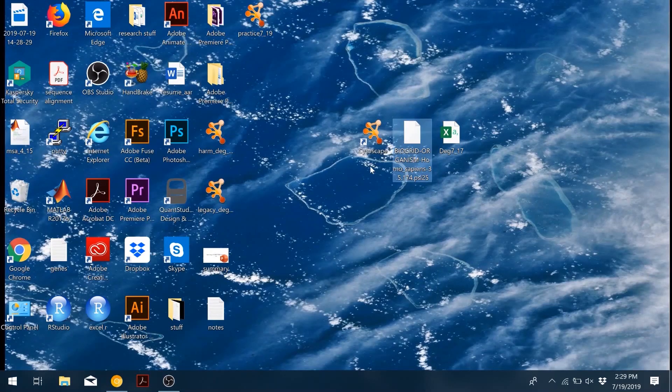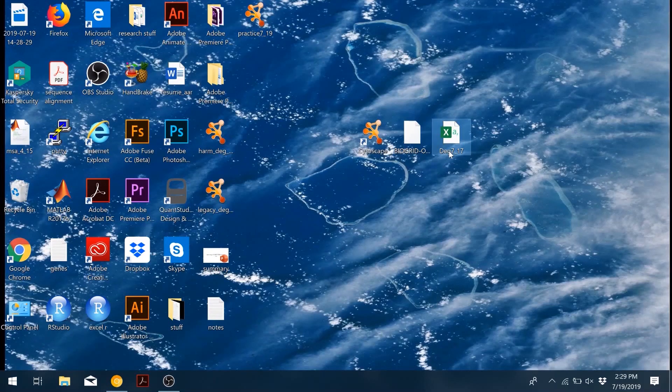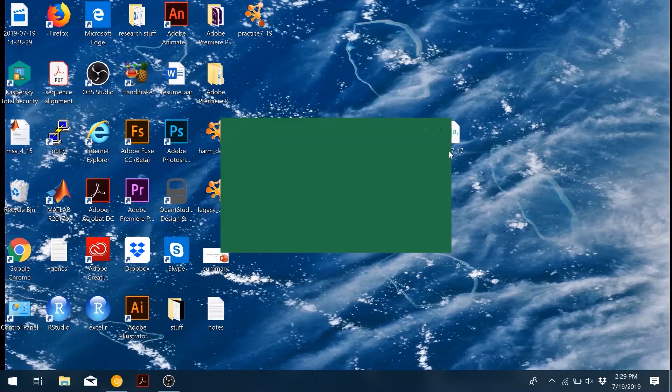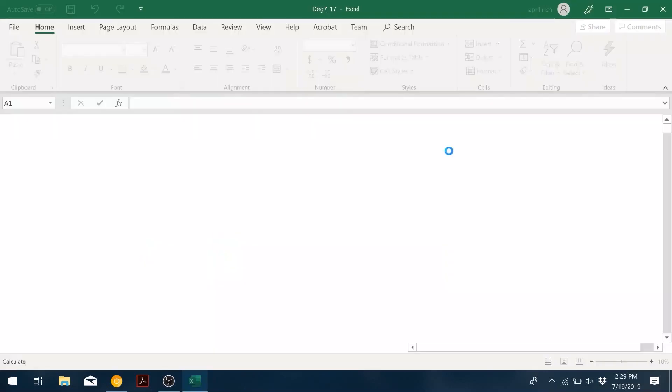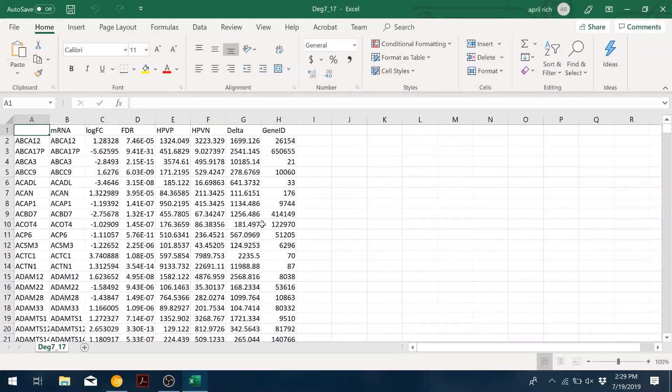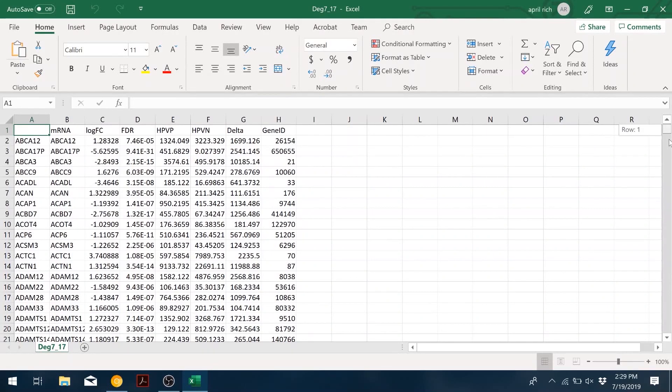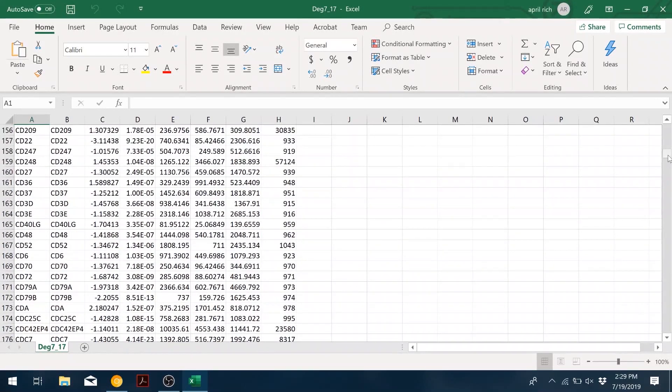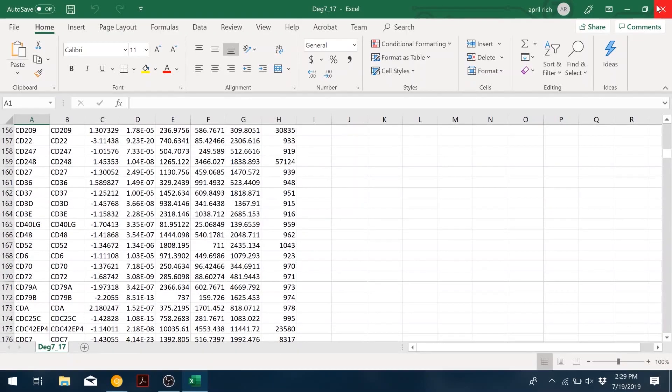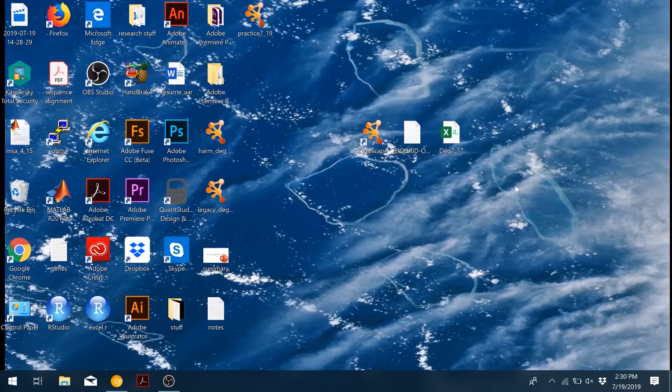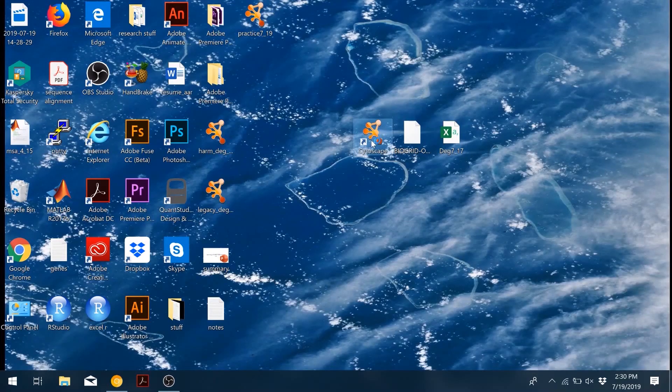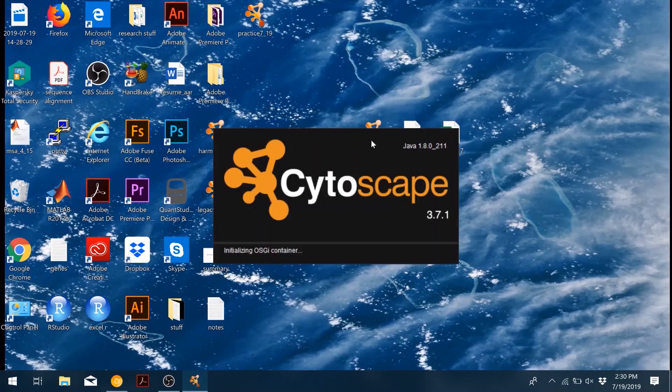So then you also need a CSV file that has all of your gene expression information, like this one here, looking at differentially expressed genes between HPV positive and HPV negative. We have things like the logfc value and fdr values, which we will add that information to our Cytoscape network.